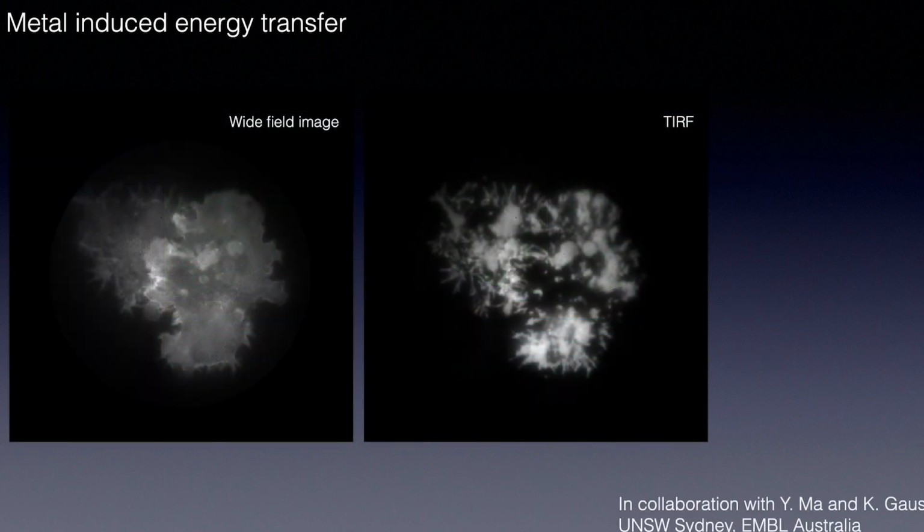On the figures you can see 3 human lymphocytes attached to the surface. Here LCK molecules located on the cell membrane are marked by GFP. It is important to mention that we can use total internal reflection fluorescence microscopy, or TIRF, because LINCam is a camera. The depth of the MIET effect perfectly matches the few hundred nanometers of the TIRF excitation depth.